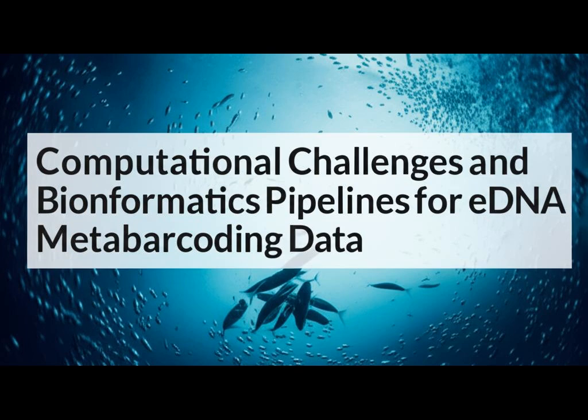A really key step is clustering, or denoising. Older methods group similar sequences into operational taxonomic units, or OTUs. Newer methods, using tools like DADA2, aim for higher resolution, identifying exact amplicon sequence variants, or ASVs.